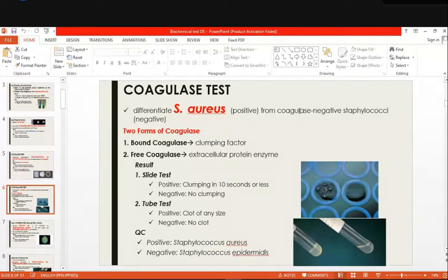The clotting mechanism of free coagulase requires the activation of a plasma coagulase-reacting factor, the CRF, which is a modified or derived thrombin molecule, to form a coagulase-CRF complex. This complex then reacts with fibrinogen to form the fibrin clot in a test tube. The fibrin clot may look solidified, like gelatin that moves, but it is no longer really liquid.